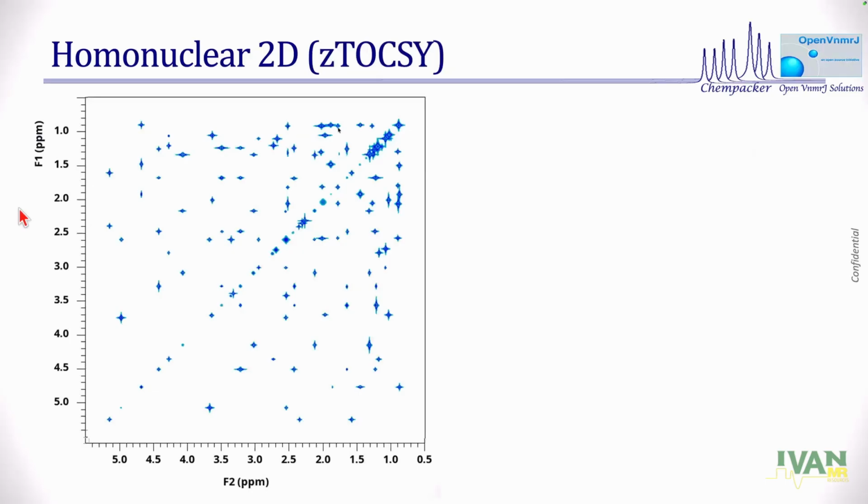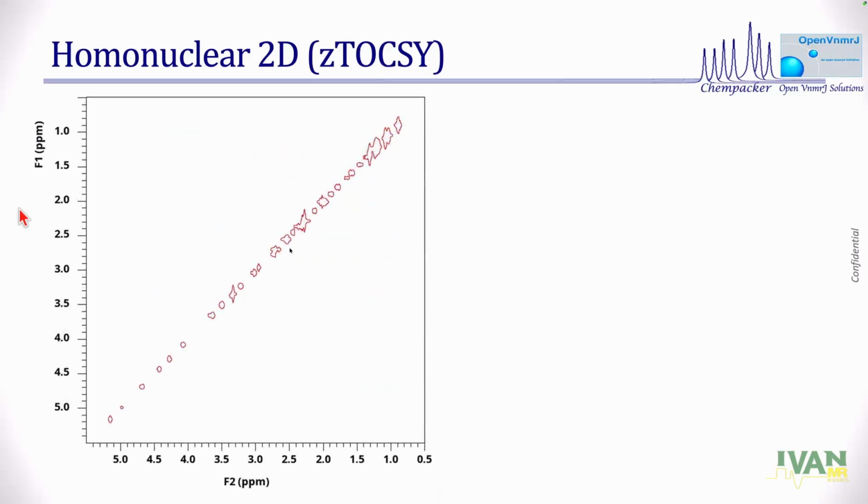TOCSY, this is my favorite. Here is a 2D spectrum of the CRAFT pure shift 2D spectrum. Very interestingly, you can do certain things with the table because it's a table. Remember, in the table you can change your representation of how the frequency domain looks by doing some kind of sorting. What's one of the most annoying things in a homonuclear 2D? The diagonals. Even in a pure shift spectrum, that's a diagonal. Invariably, if I work with a very small mixing time, it's too big. So I can sort it out.